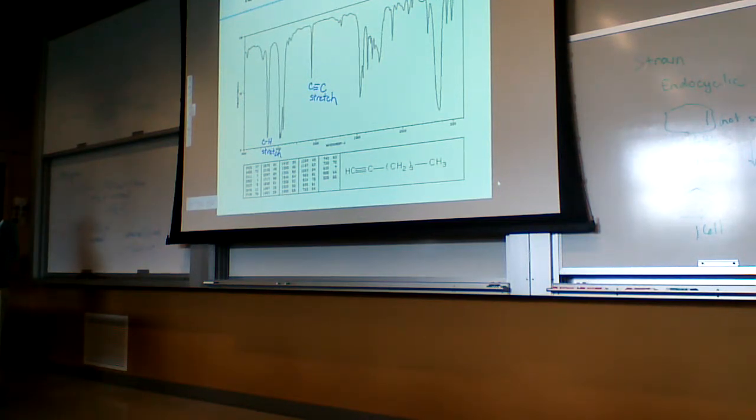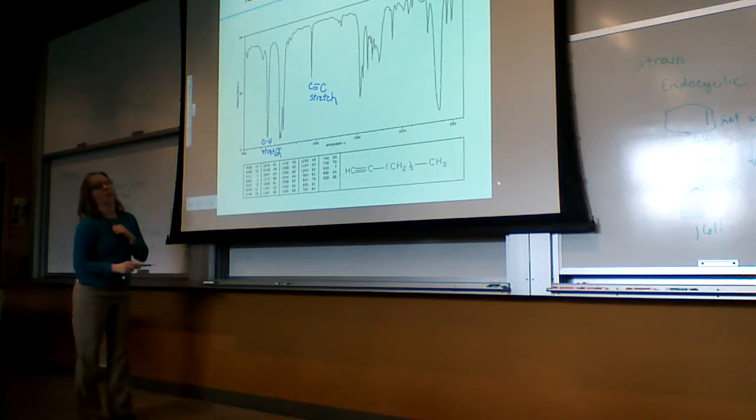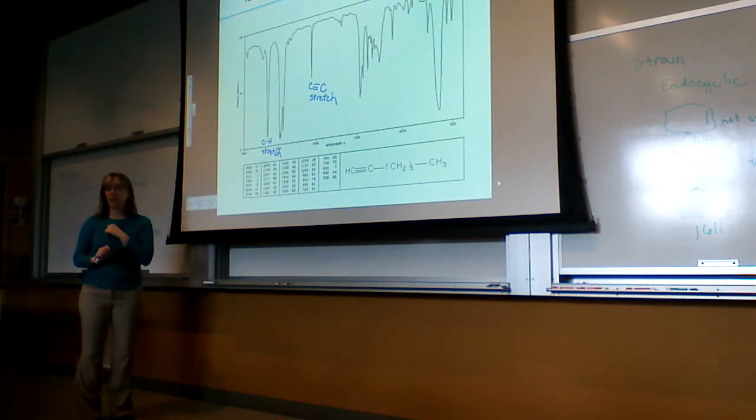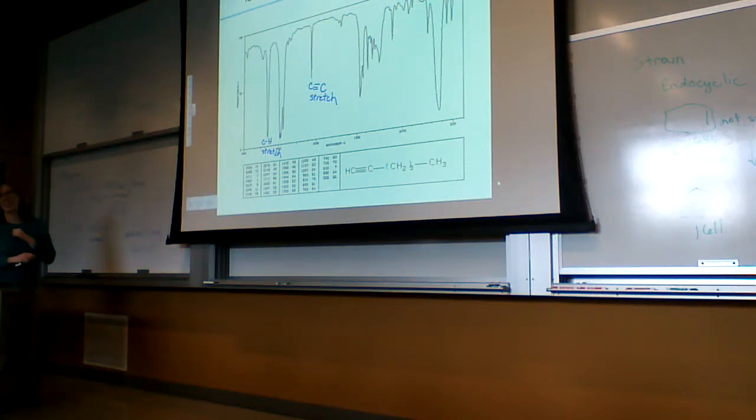And if you see a real strong peak without the CH, then you know it's a nitrile. If you see the CH and a strong peak, then you know it's a terminal alkyne. Internal alkynes can sometimes be invisible in an IR spectrum, so you might need a different form of spectroscopy to identify those. So nothing new there, hopefully, no new surprises. Okay.